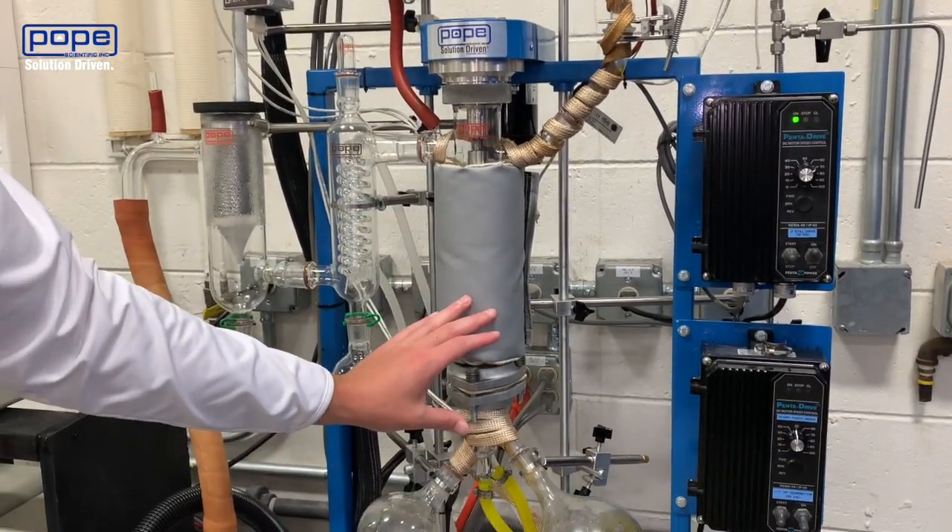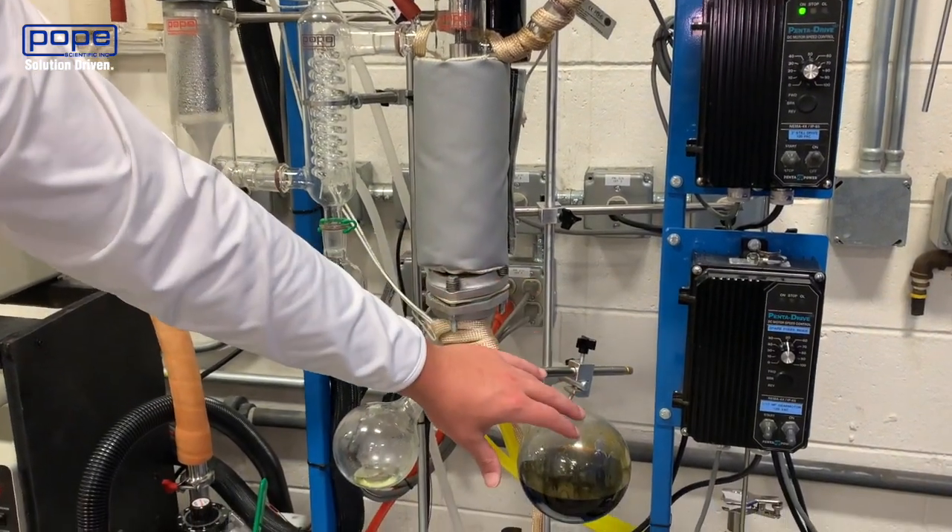Everything else, including your cannabinoids as well as residue, will be coming down into your right flask here.